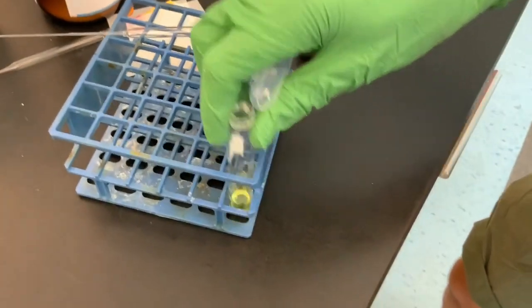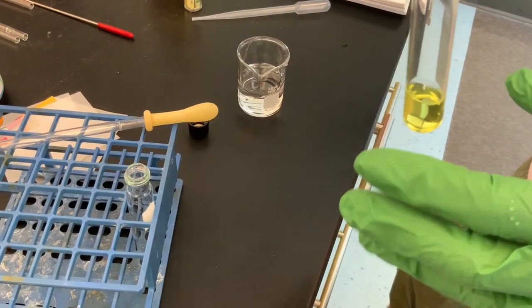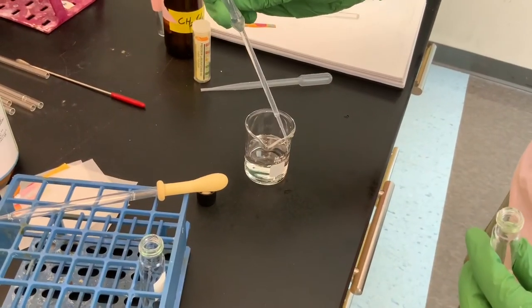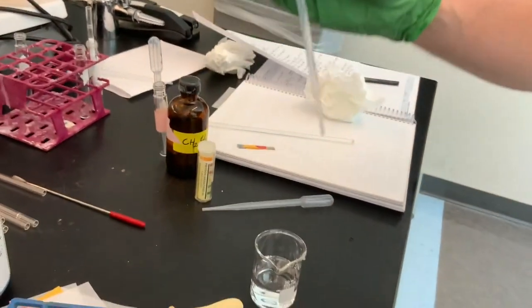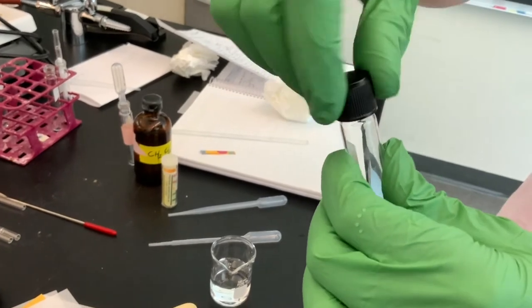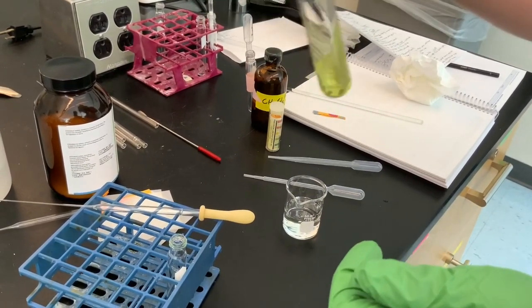Okay, so now we've got our methylene chloride, and what we want to do is wash this with water, just to get rid of any residual acid that might have been present from the benzoic acid extraction. The procedure says to do 2 times 1 milliliter. So this is a 1 milliliter graduated disposable pipette. I'm just gonna add 1 ml to it. Gonna gently shake it, especially getting the sides to get any water that was there out. And this is pretty general. We wash the organic layer this way.